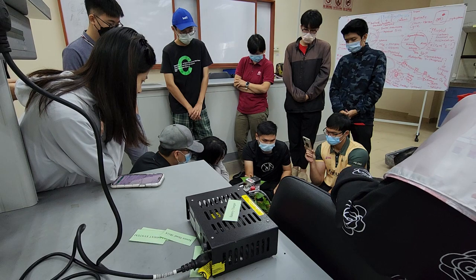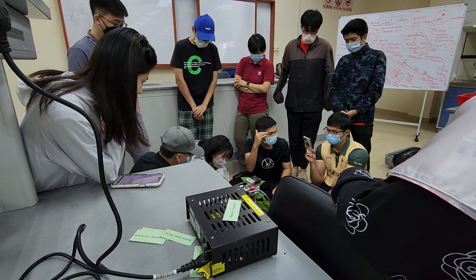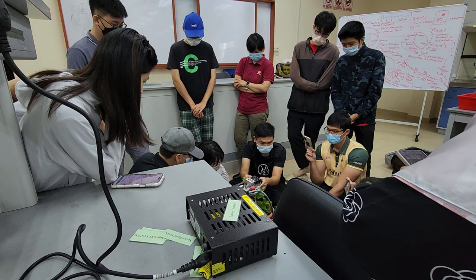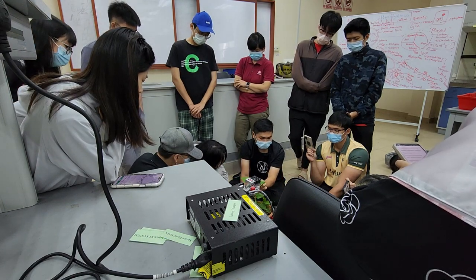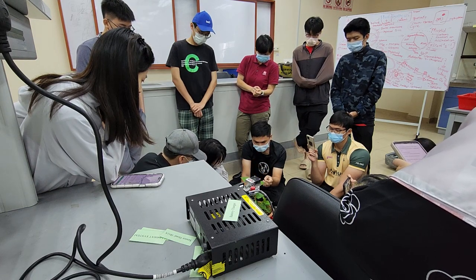The general rule of thumb is we take from the top 3 to 5 leaves. Counting from the top, this is leaf number 1, leaf number 2, leaf number 3. This will be good, until number 5. Pick the healthiest leaf, because if there is damage on the leaf, it will affect the reading later.